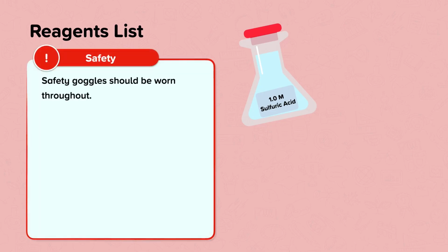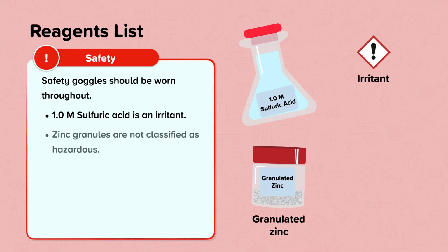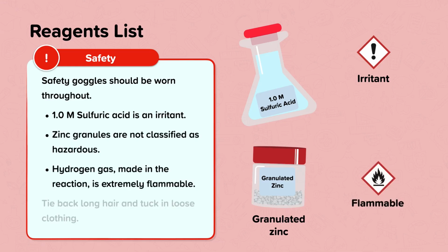As always, safety goggles should be worn throughout. 1.0 molar sulfuric acid is an irritant. Zinc granules are not classified as hazardous. Hydrogen gas, made in the reaction, is extremely flammable. Remember to tie back long hair and tuck in loose clothing.